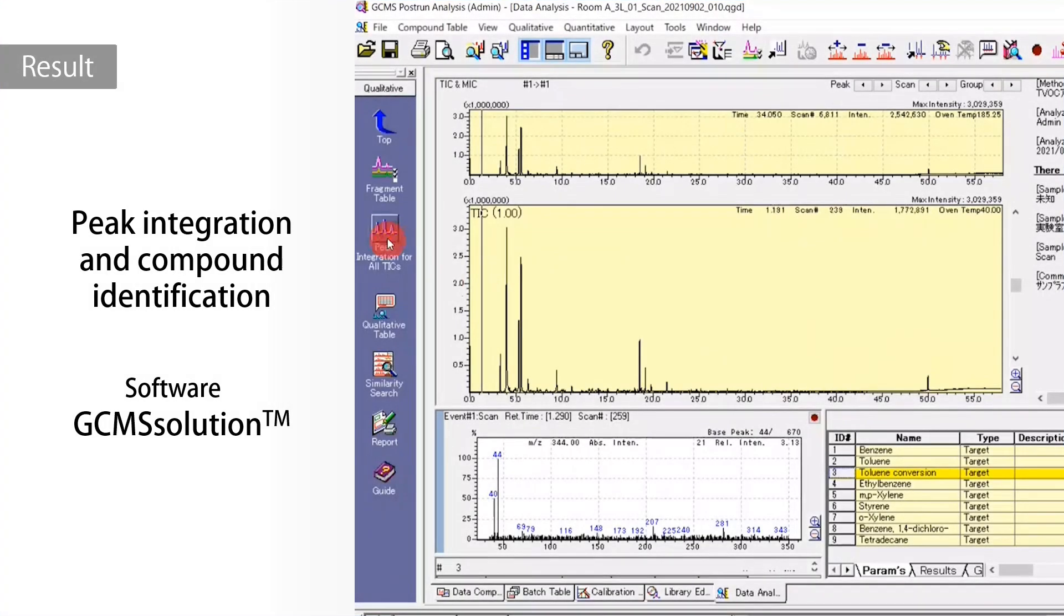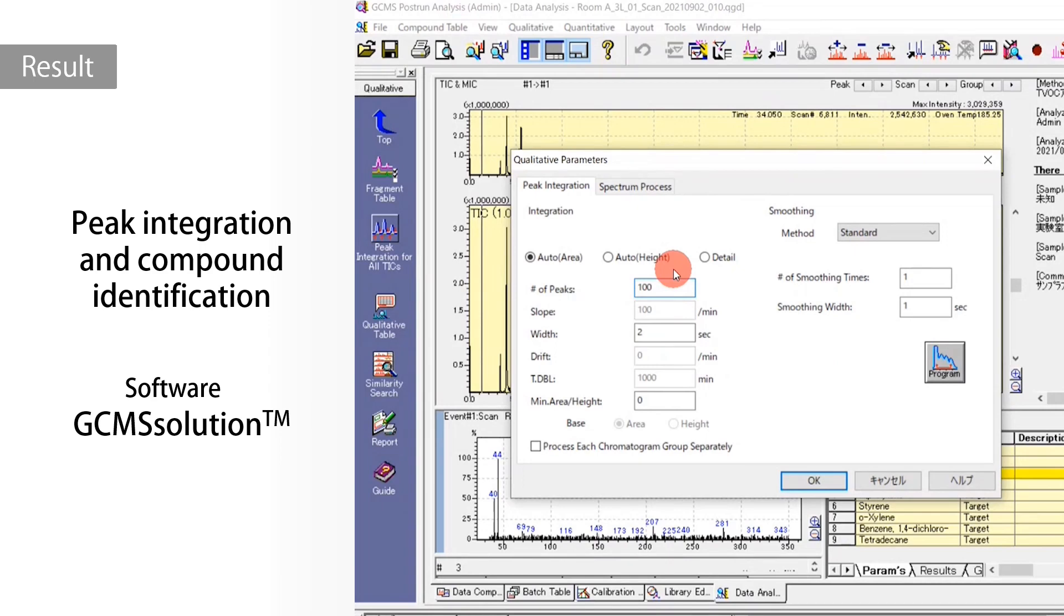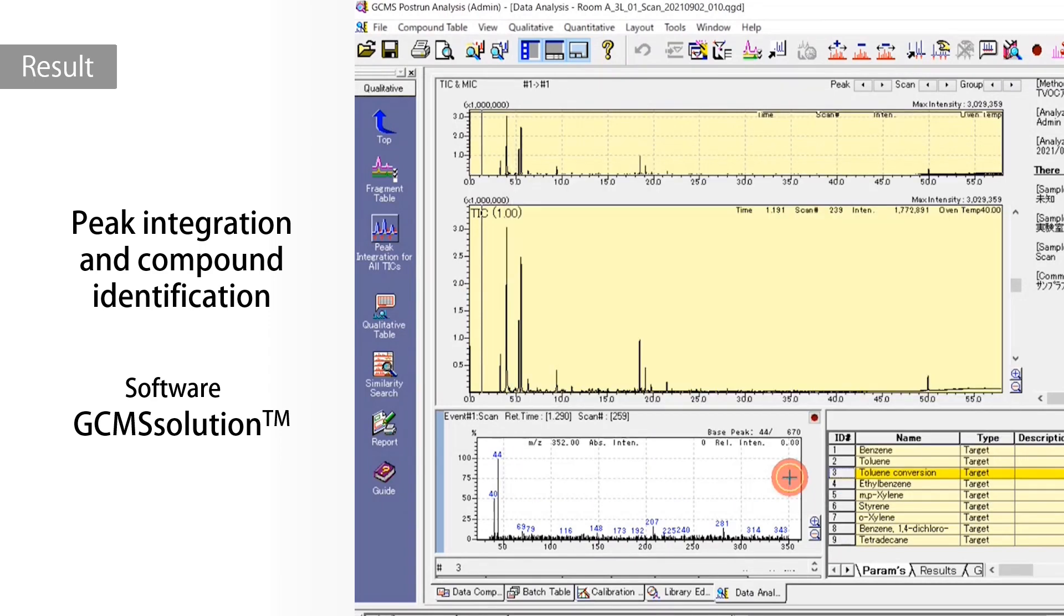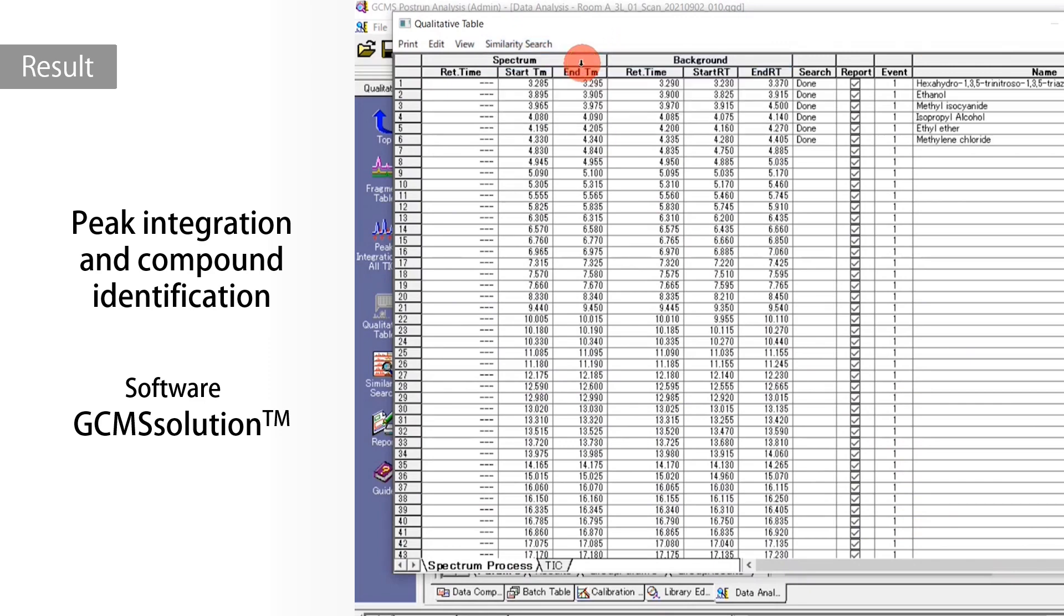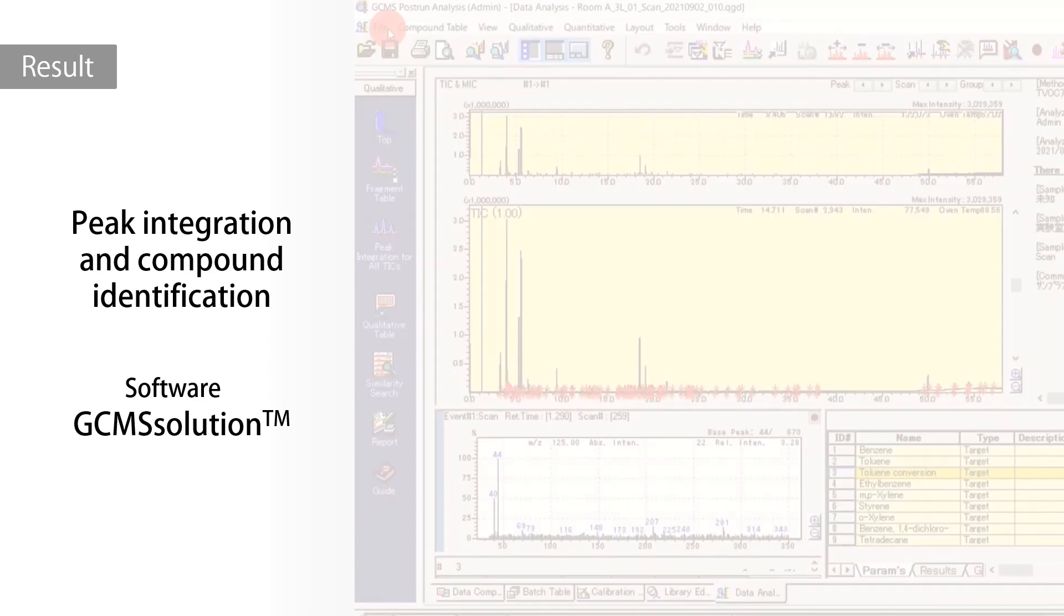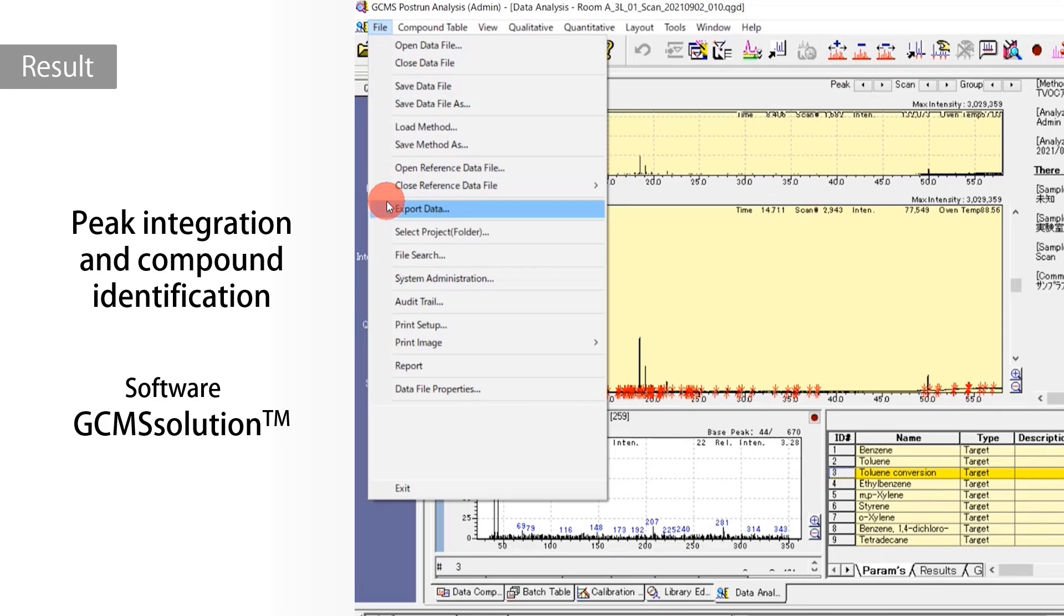After the measurement, data was processed with GC-MS solution. All peaks were integrated, and their corresponding compounds were identified. The results were exported in a CSV file.